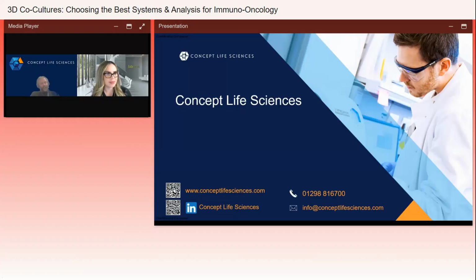I've not done that yet. It's not been a question we've been asked to solve yet. There's no reason why you couldn't. They probably would go in. I think the reluctance I've had there is essentially coming from my background, that I know that T cells tend to enter a system rather than already be there. So there's no reason why you can't.